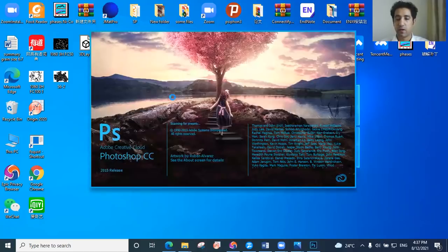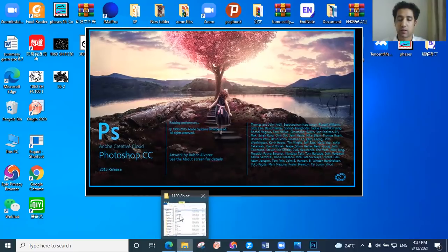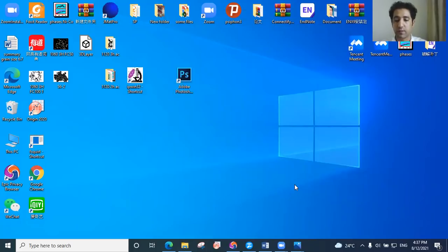and then when you open the app, we'll just wait a moment until the app is opened.